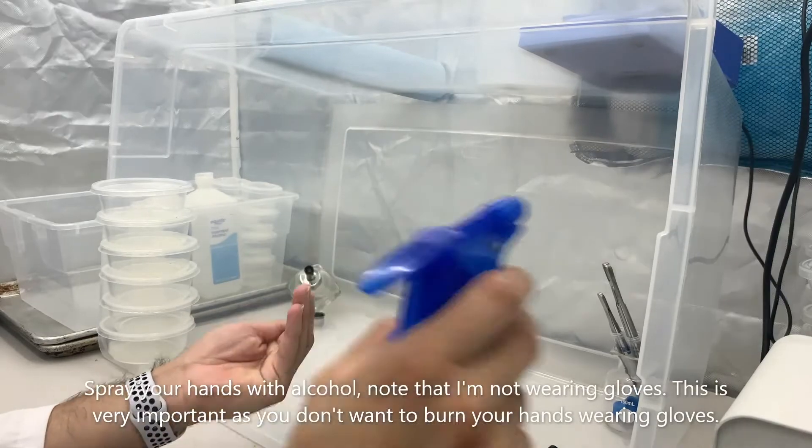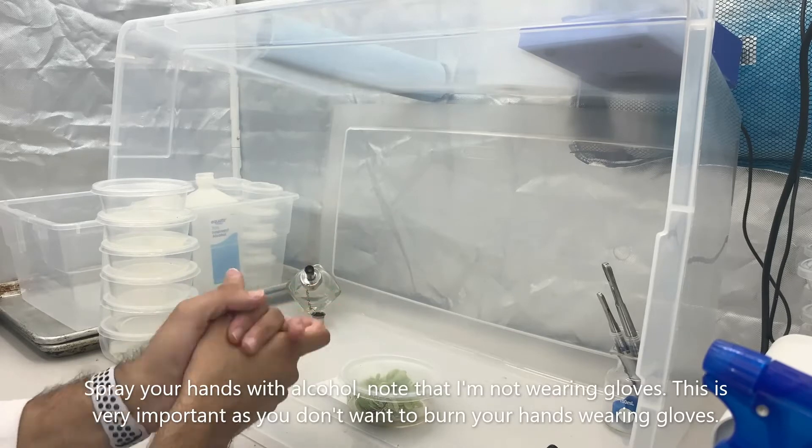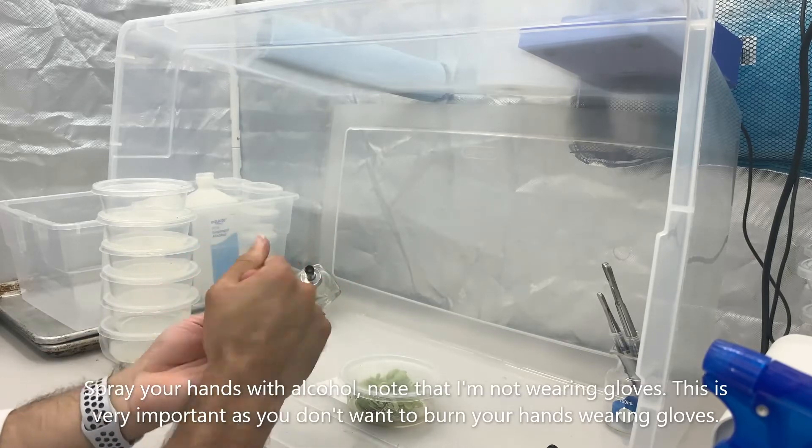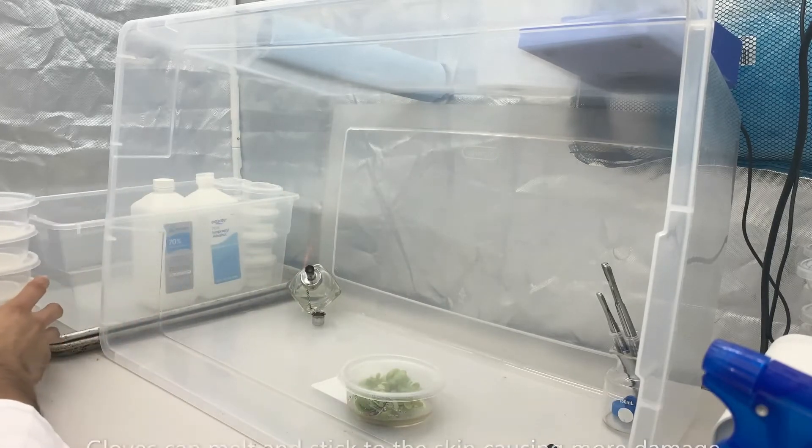Spray your hands when working in any sterile environment. You may note that he's not wearing any gloves. That's very important so you don't burn your hands. Gloves can melt and stick to the skin causing more damage.